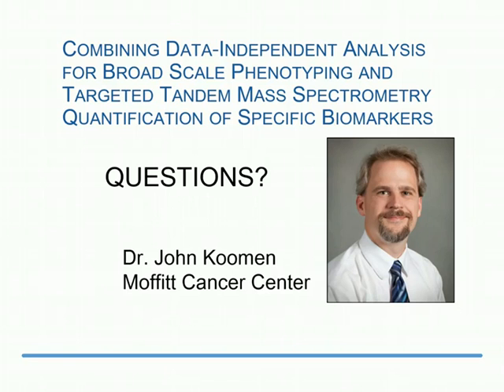So I think you can apply it to any type of concept that you want. I mean, the main focus that we have is to try and simplify some of these measurements and make sure that you get the quality of measurement and the depth of measurement that you want within one single LC-MS/MS analysis, and that's where we think it helps the most.